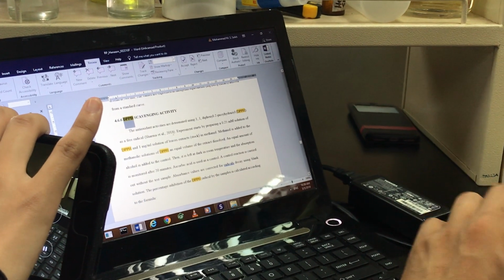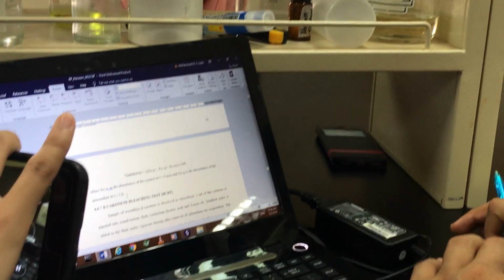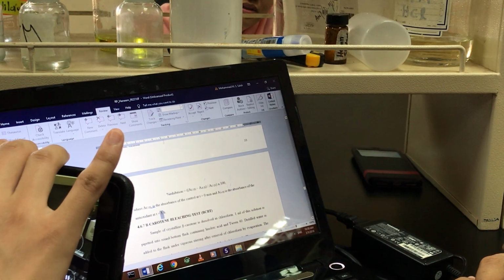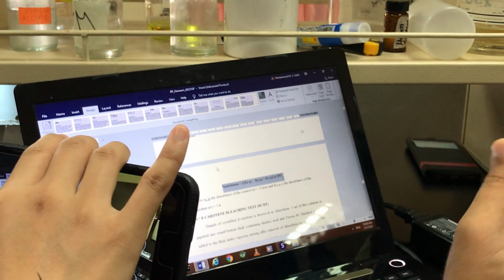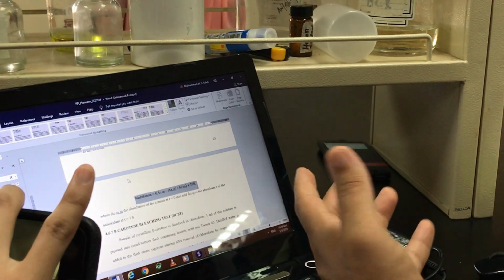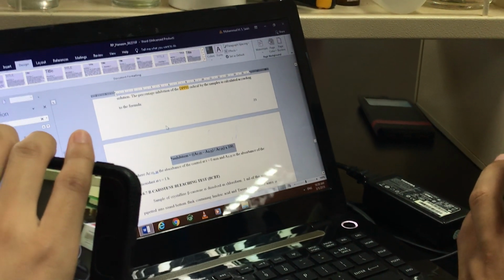Ours uses different methods. For DPPH the calculation is similar, but she used after 1 hour, we used after 20 minutes. Never mind, because a lot of researchers use DPPH with different methods, even different concentrations of DPPH.